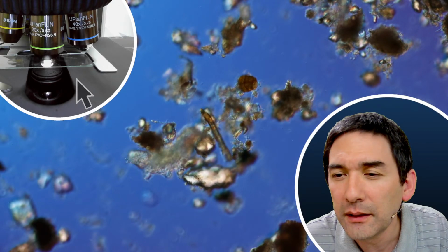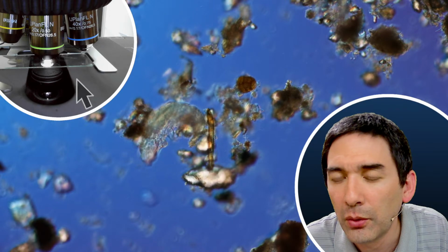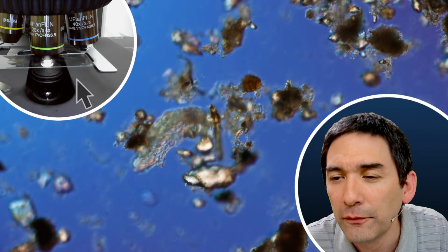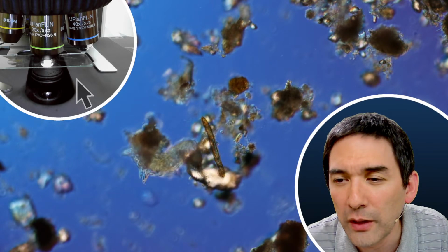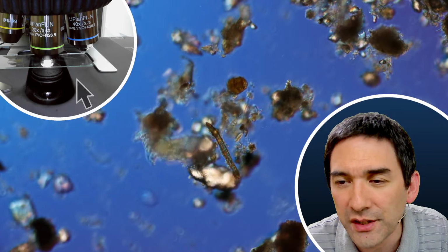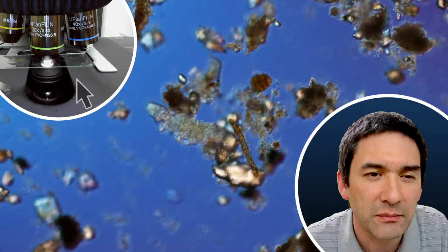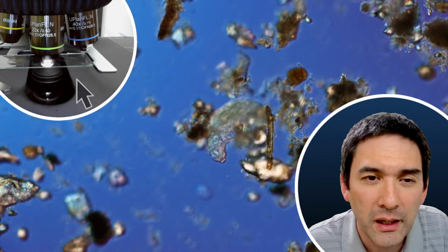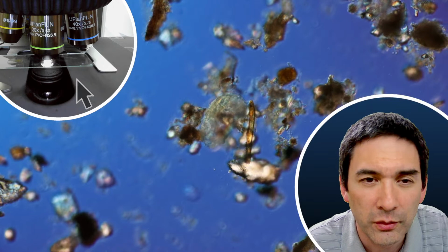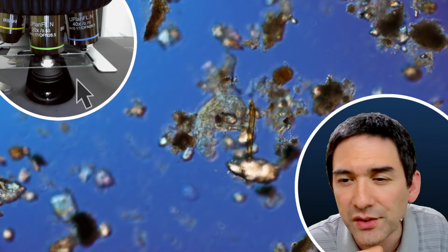Yes, I did use Q-tips, wipes, isopropanol, which is fine. Non-ammonia glass cleaning solution, none of them is helpful. Q-tips and wipes. It could be that you were trying to clean a place where there was no dust. Sometimes the dust is somewhere in the optical path, and even though you were trying to clean the surfaces, you were not cleaning the place where the dust actually was.